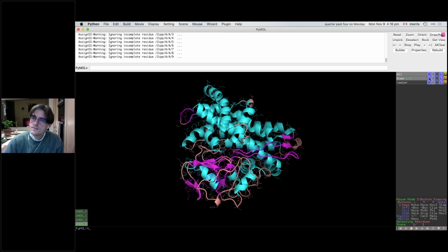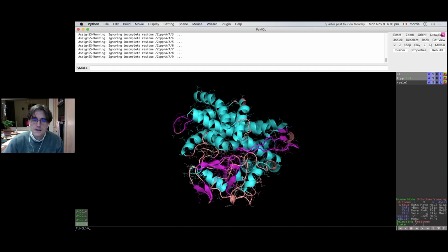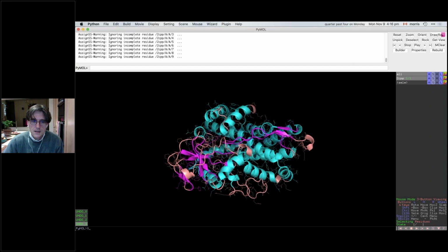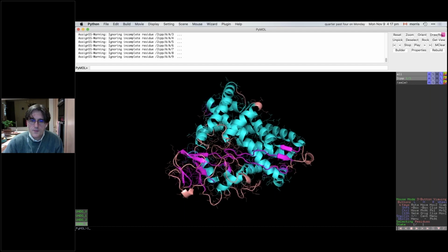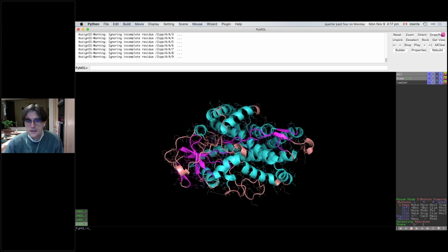Would it be true then to say that we should regard PyMOL as a viewer? It has more capabilities than just a molecule viewer. It can do energy minimization and so-called sculpting, and I'll try and demo that at some point during this. But it is largely a viewer, though you can indeed do energy minimization using its sculpting feature.